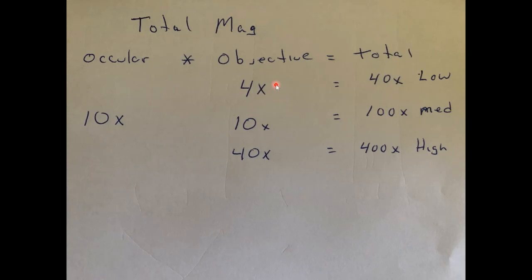So you just start with low power and you make your progression. And if something happens, the wheels come off, you just go back to the last objective you used. And you'll get the hang of it. It probably sounds more complicated than it really is. In a real life lab, in a classroom with 24 students, I can probably get 20 of them to find an object like blood cells at high power within about 20 minutes. But really, you just have to have your hands on.